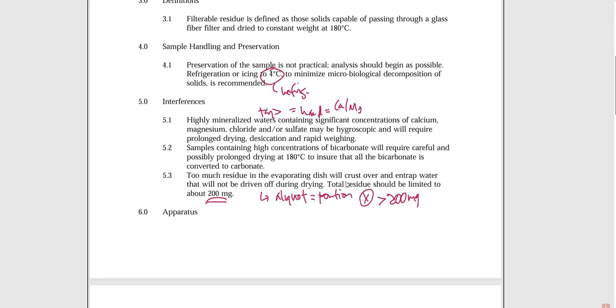If you do, then toward the end of this, there will be so much solid that it will form a layer over the water that needs to evaporate off. That surface is like ice over a frozen lake, right? It is going to be very hard to break, and we don't want that risk to happen.